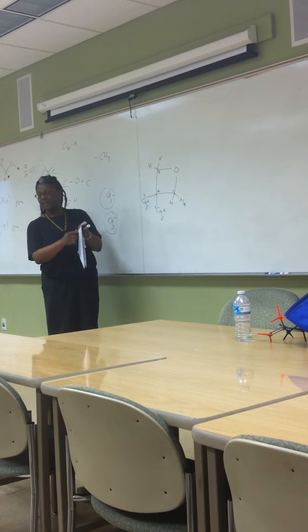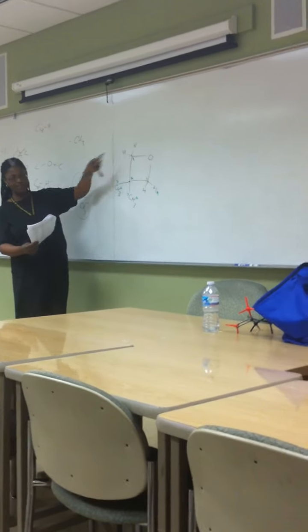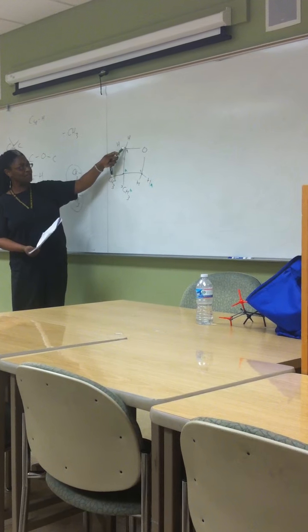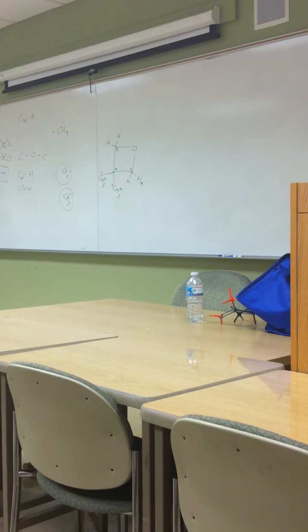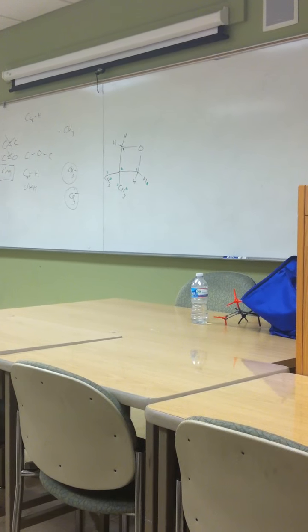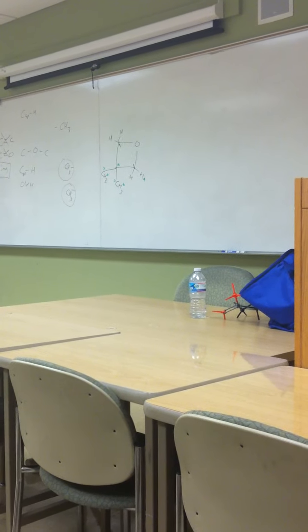Just from the table, you would expect a value of 1.3 for this hydrogen. But because this carbon is attached to an oxygen here, it's going to end up being 3.5. So that would fall down here with the RCH2X, between 3 and 4. So that would fit into that one.